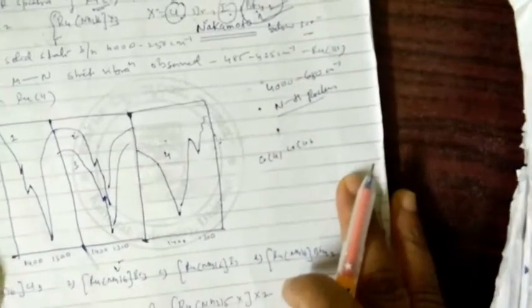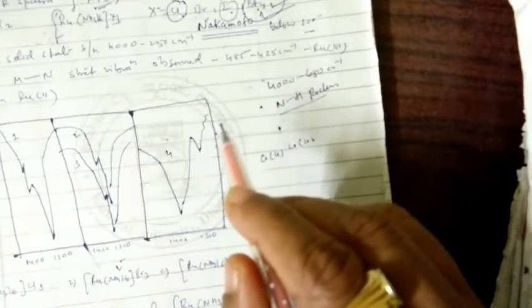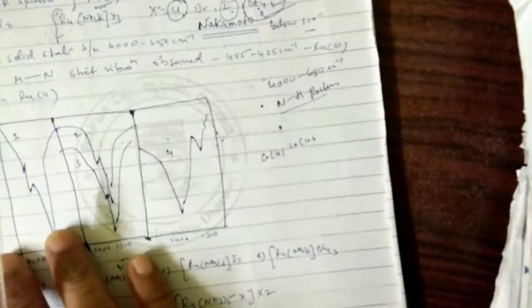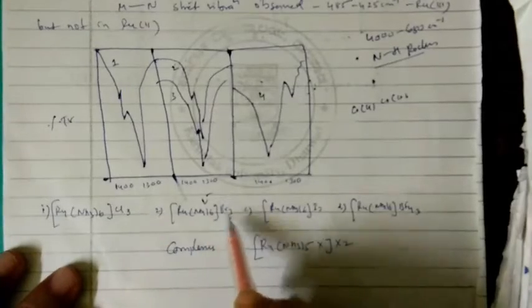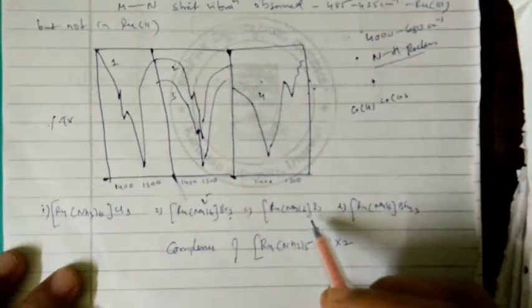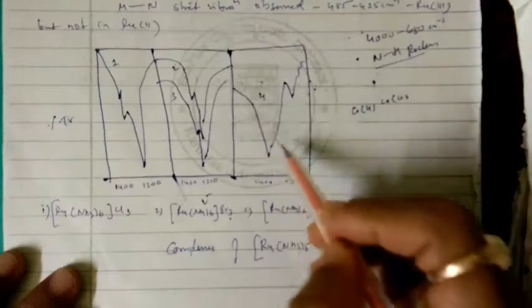Here the NH3 symmetric deformation mode of these complexes is split into a number of bands, and I have shown one typical band here. You can see here the spectra of ruthenium hexaammine Cl3, then Br3, then the third one I3, and the last one is BF4 3.